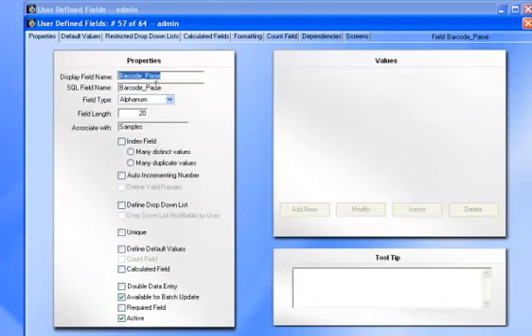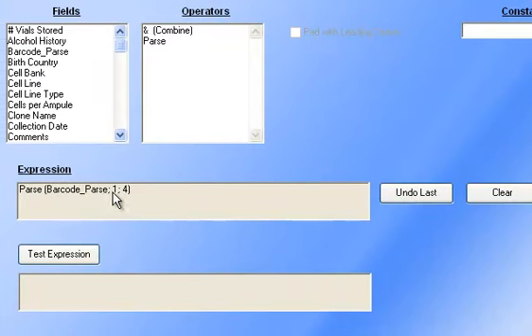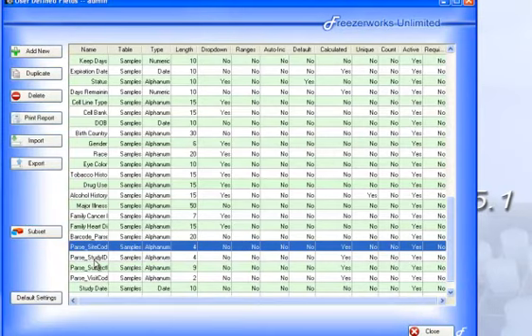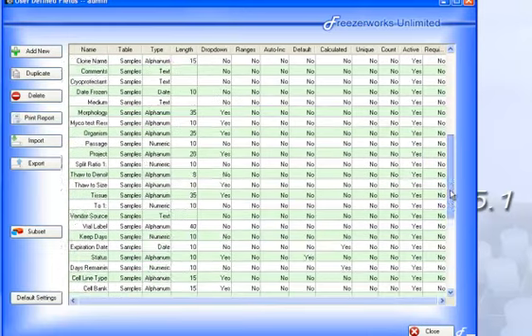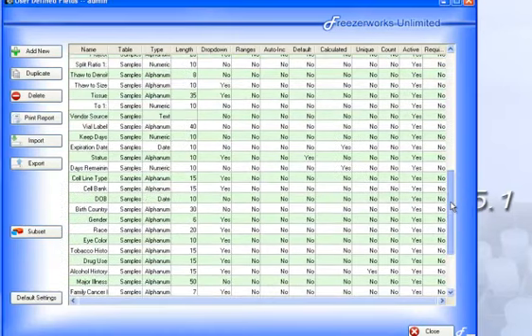That was a field that we could scan in, and when we scanned it in, fields like site code were calculated fields where we parsed the first character to the fourth character of that number, so that we knew the first 4 characters would be the site code. The next 4 characters maybe the study ID, and so forth. Another field I didn't show, but we'll go back and look at, are count fields.